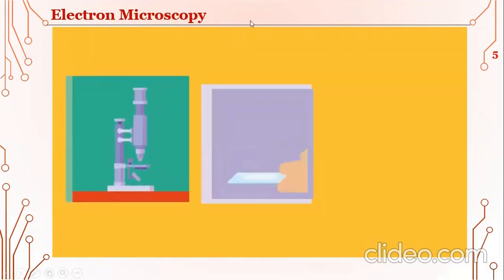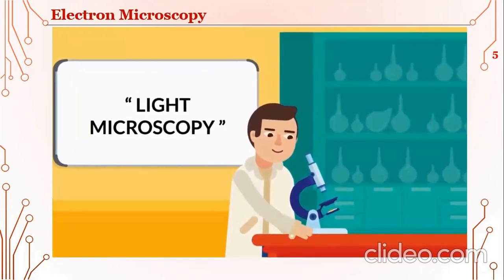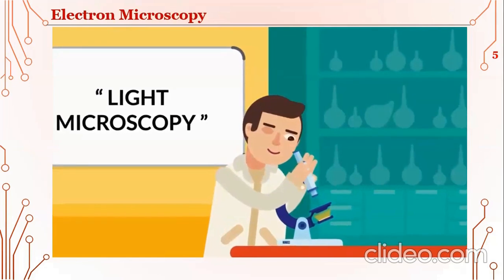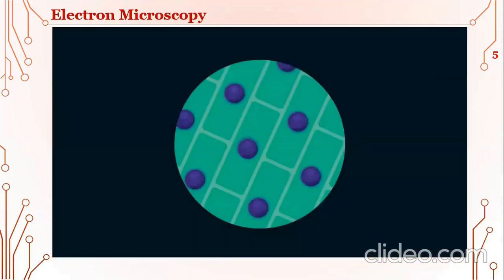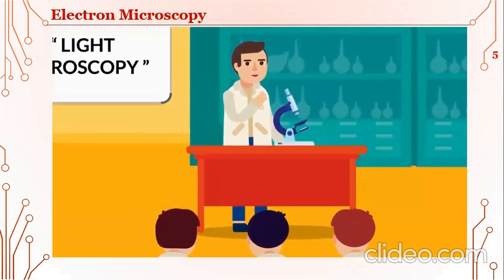design, slide preparation and examination is called cytology. Light microscopy. The light microscope uses light as a source of radiation and has shown us inside cells. It shows us simple structures like the nucleus, the cell wall, and the cell membrane. A light microscope is still used in basic studies in schools today.